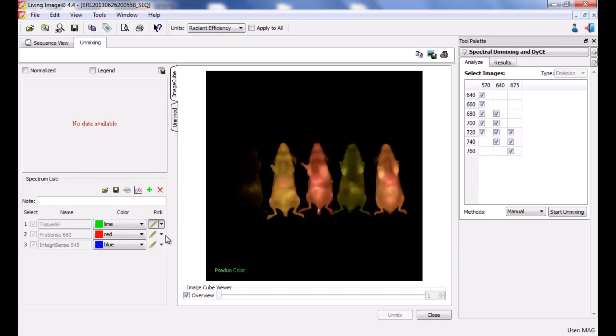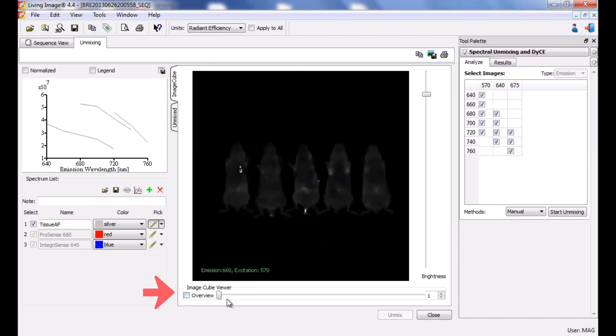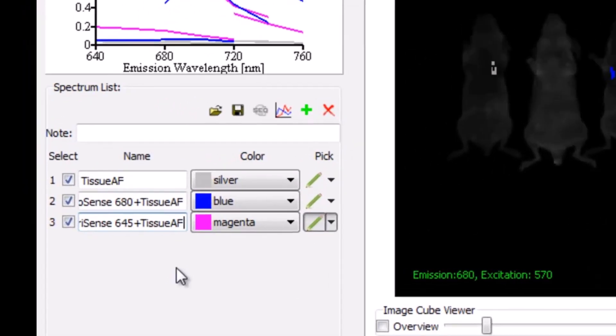To begin, select the first pen tool next to the tissue autofluorescence component. Draw on top of the image over the mammary fat pad. If visualization is difficult, deselect overview, adjust the brightness, and scroll through the different filter pair images. Repeat these steps with the other two components. Find the location on the image where each probe is emitting light and draw over the light emission using the pen tool. The remaining two components actually represent the probe plus tissue autofluorescence.